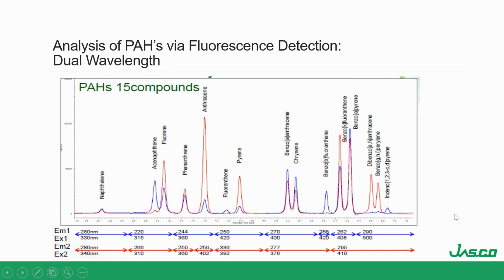So you can see fluorescence detection is much more specific than, say, a UV-Vis detector. If you're working with a UV-Vis detector and you have some sort of ring structure or some type of chromophore, you can get a lot of those compounds with two wavelengths, 254 or 220. And that is not the case with fluorescence detection. It's much more specific, but as long as you have the ability to switch excitation and emission wavelengths really quickly, and you can monitor a couple conditions, you should be able to get everything that you need.